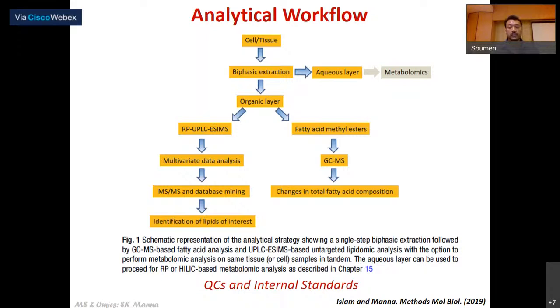And you have to remember that when you are producing methyl esters, if you use something like an acid, methanolic HCl and stuff like that, it will not only esterify the free fatty acids, but also the esterified fatty acids, that means the complex lipids. So you have to keep in mind that you are looking into the entire set of fatty acids, either conjugated or unconjugated.